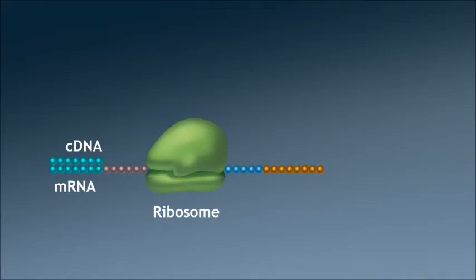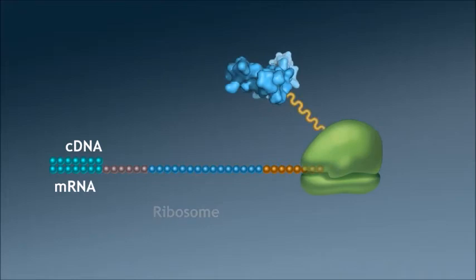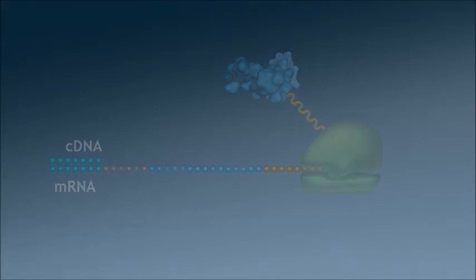The first method is called ribosome display. In ribosome display, we start with the mRNA containing the gene of the protein of interest. Reverse transcription generates the cDNA barcode. The ribosome then translates the protein in a cell-free system, and then stalls in the absence of a stop codon, forming a protein-cDNA barcode complex. This method can barcode up to hundreds of millions of different proteins in a single assay.